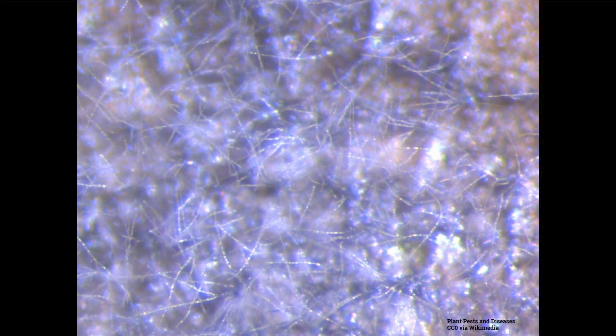Mm-hmm. You'll see on the lesion itself what looks like pieces of little pepper, black. And then you'll see the little cobwebs and all that kind of stuff if it's sporulating. If it's not, then it's kind of difficult to tell the difference. What does Cercospora look similar to in sugar beets?